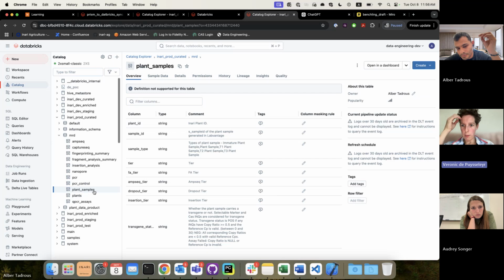Those assays are run independently. The issue in Gantt is that sometimes we do the AMP-seq first, and then we do the TaqMan later. So we do not have the information available when we create the sample. It's different information coming from a different assay. Having it in that table is a bit problematic.